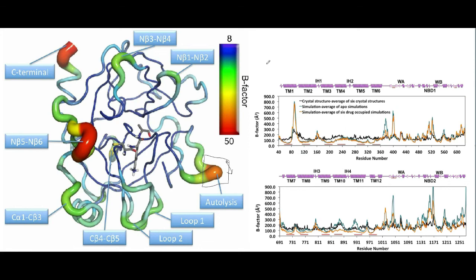These images were taken from different things, so these are not the B factors that we see here. I just wanted to illustrate that you can get B factors for the different residues on your protein chain. This is the N terminal domain over here. This is the C terminal domain. So these are the amino acids in our protein, and you see that they can have these different B factors.